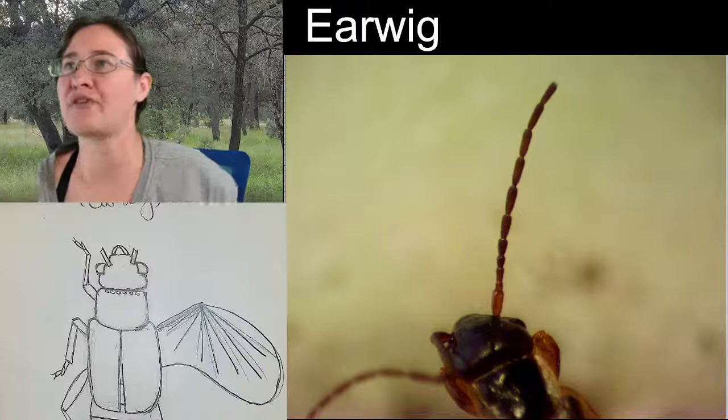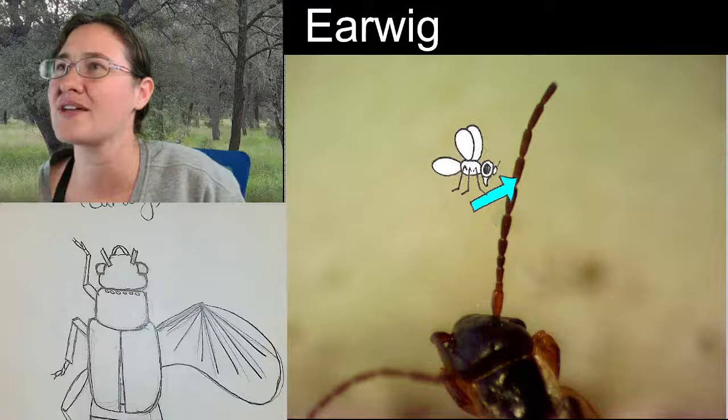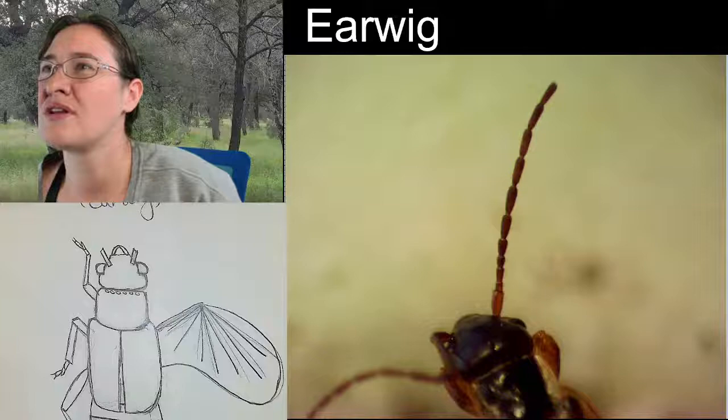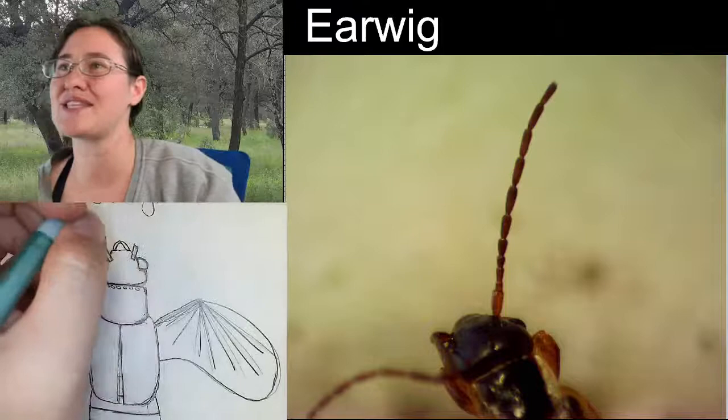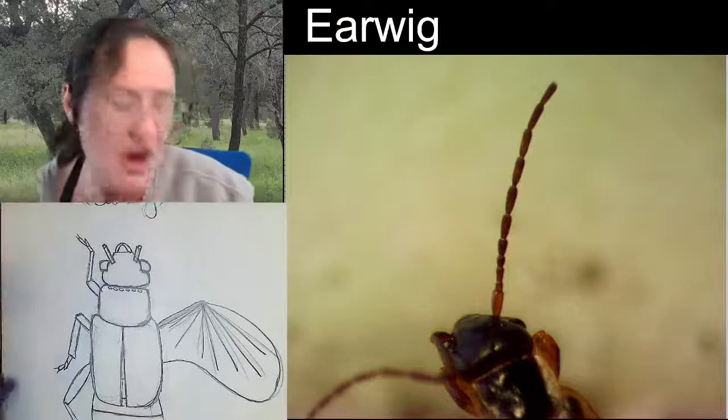So, we can actually count the number of segments. We have 1, 2, 3, 4, 5, 6, 7, 8, 9, 10, 11. I'm going to go ahead and count that with my mouse really quick. Yep, looks like we have 11 segments. Obviously, the first one is the scape. That little itty-bitty one after the scape is the pedicel. And then the rest of them are the flagellum. And if you are counting just the segments on the flagellum, there are 9 of them.